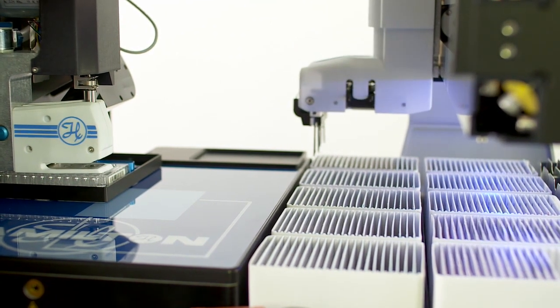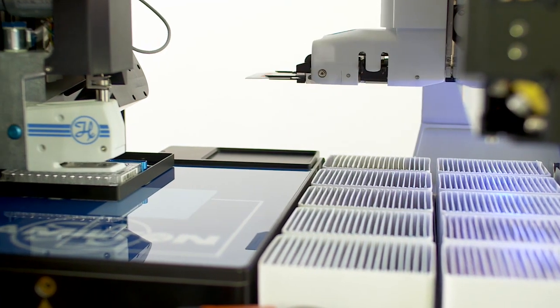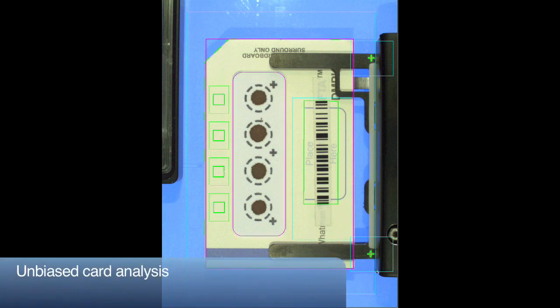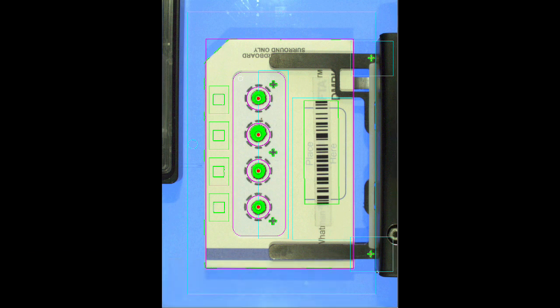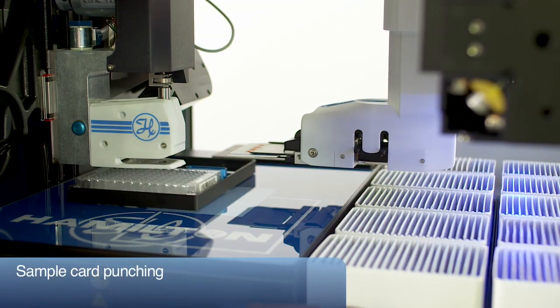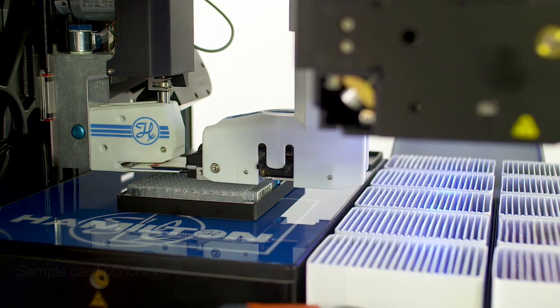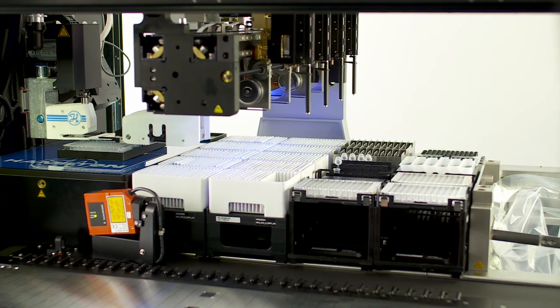A card is picked up from the magazines and moved to the table for imaging. The image is automatically analyzed for certain parameters, such as barcode and sample location and shape. The punch position will then be determined according to the predefined imaging parameters. The card is inserted into the punch head and the determined position is punched into the target well of the receiving plate. An ejection pin makes sure that the punch discs eject properly from the punch itself.